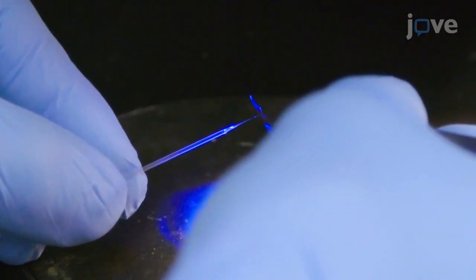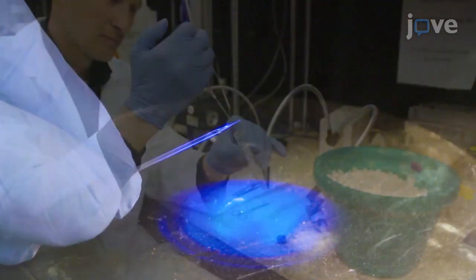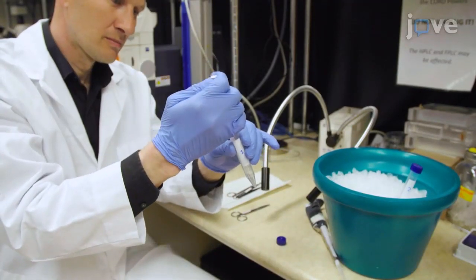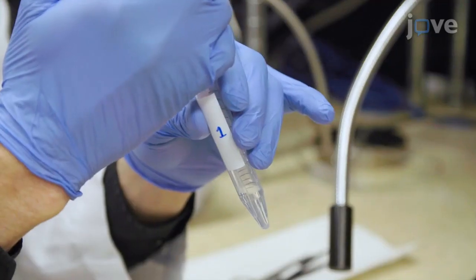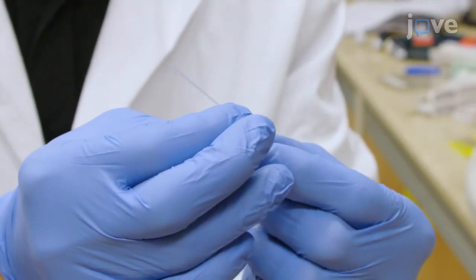Break the tip of the borosilicate needle using fine forceps. Load the syringe with 50 to 200 microliters of the cancer cell suspension, and insert the borosilicate needle into the tubing.